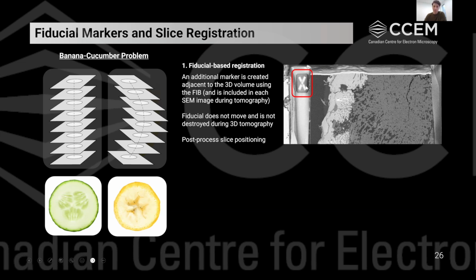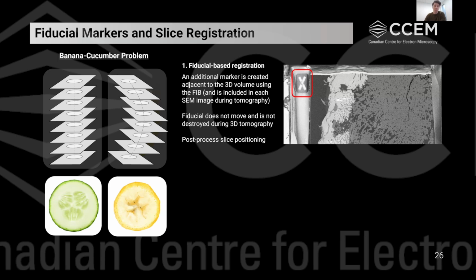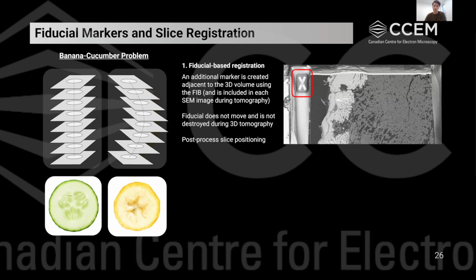It does not move, meaning that if we use this to position each image in the stack, and we position the images such that this X is in the same spot, but our Z is varying, we'll get a true to size 3D volume that is properly registered and the slices are properly aligned with one another in 3D.